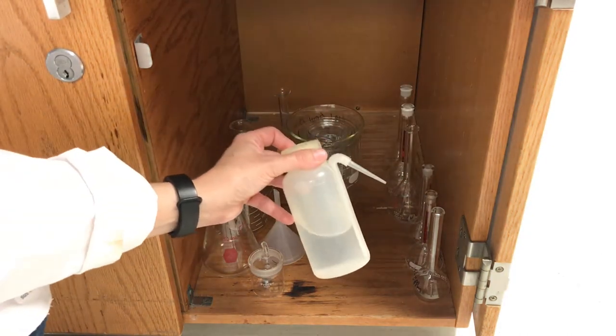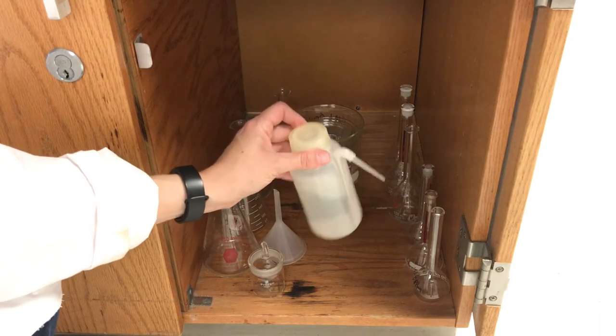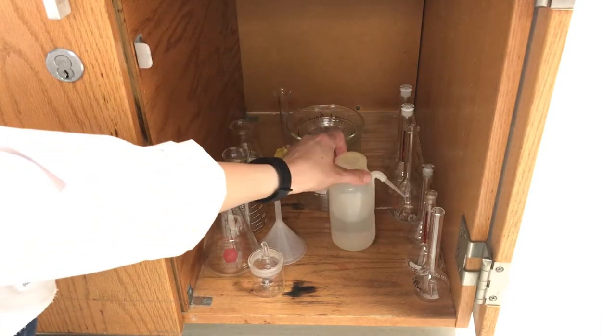A wash bottle. If yours is cracked or doesn't spray water efficiently we'll replace it. Let me know.